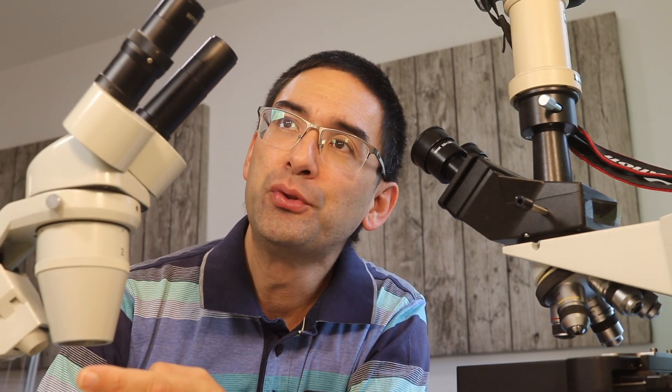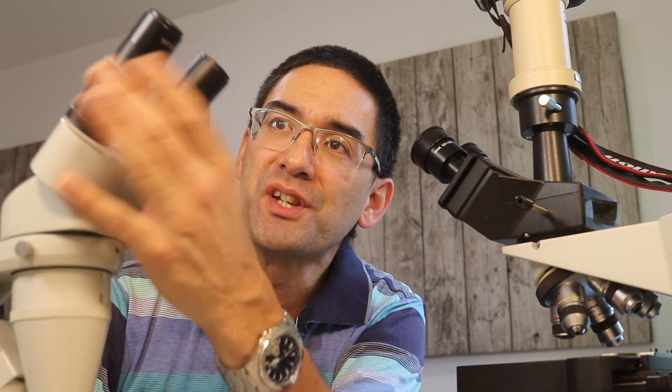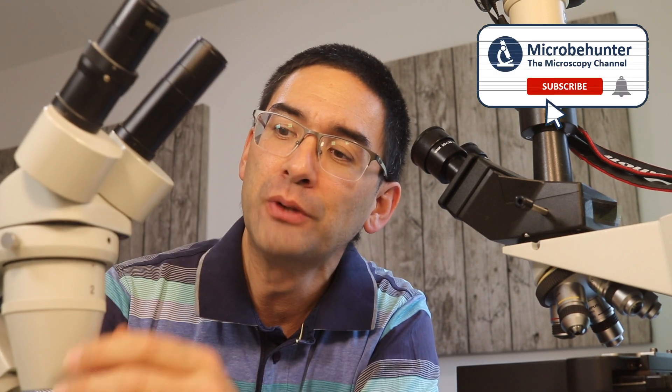So this here is a stereomicroscope and what they do is they produce an upright image. They produce a stereoscopic image, a three-dimensional image, but also an upright image.